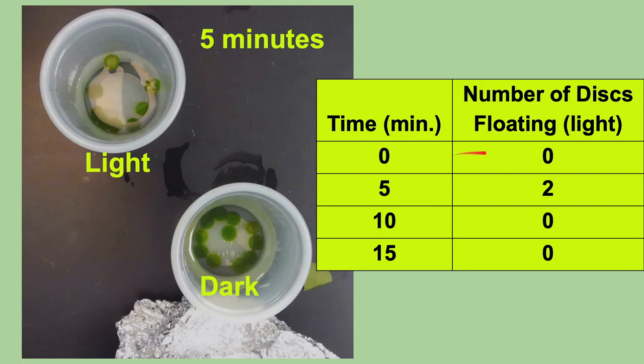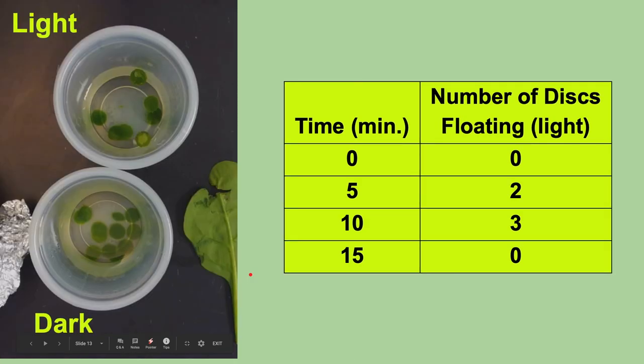So after, for example, zero minutes, no one's floating. After five minutes, we are going to record that two disks are floating. We can count them - one, two are floating that were exposed to the light. And we uncover the one in the dark and we peek in and we see no one's floating. So cover it back up, put it back to the light source, wait another five minutes.